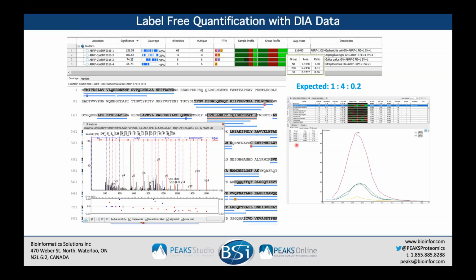And again, this is done based on the precursor, and this is an example of what that precursor looks like. So you can see here, this would be the 4 to 1. These would be the 1 or the ones, or the middle group of 50, and this is the low 0.2 group down here.